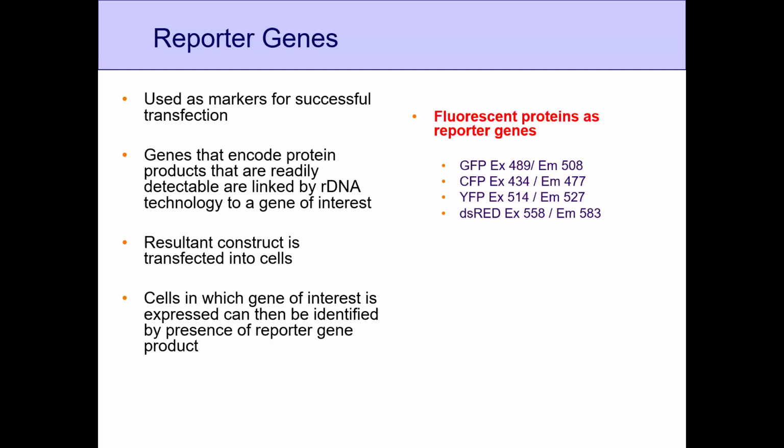Okay, you can use it for reporter genes also. What do reporter genes mean? Basically, maybe in future, or maybe some of you are doing transfection of cells, right? You express your GFP protein, YFP protein, RFP proteins in those particular cells. Then you go to your flow cytometer and check what percentage of cells got those particular genes. So to check the encoded protein, whether your cells got the GFP expression or not, you can do that as well. So this is for those reporter genes.